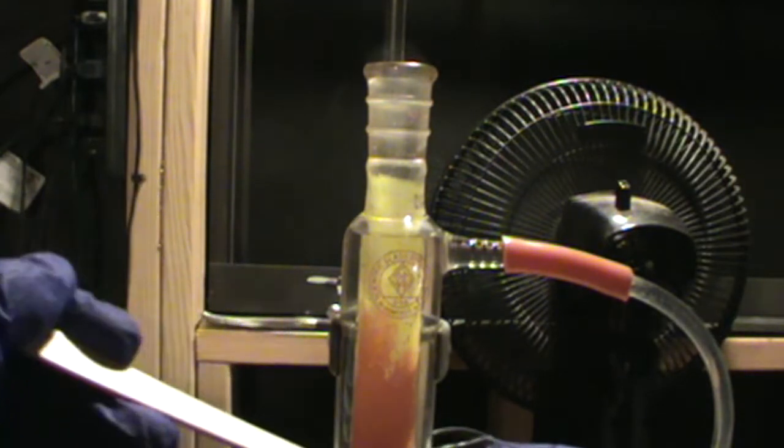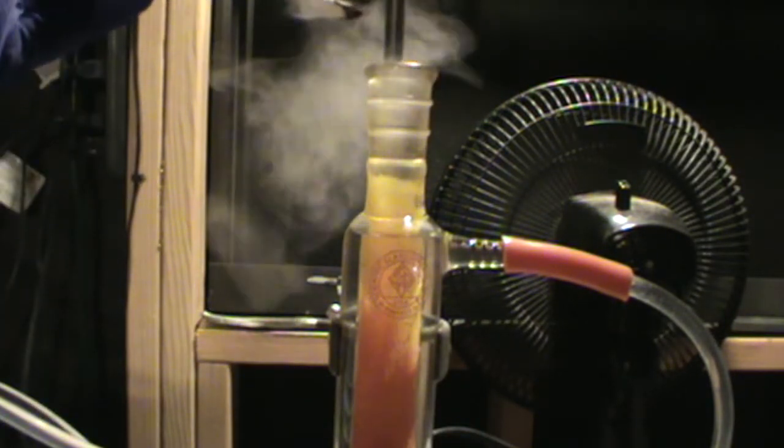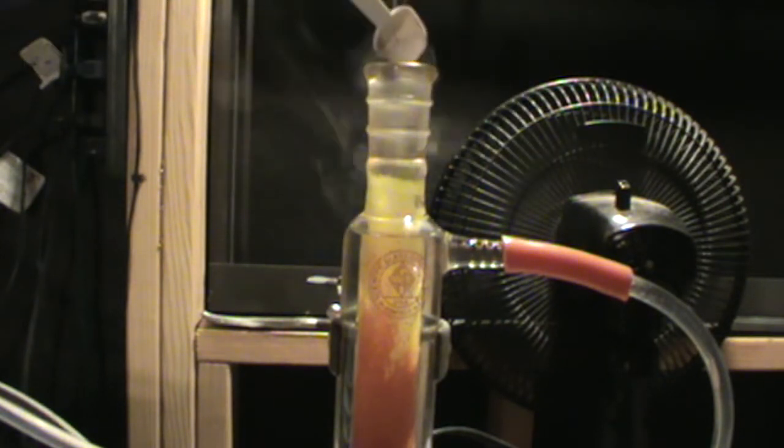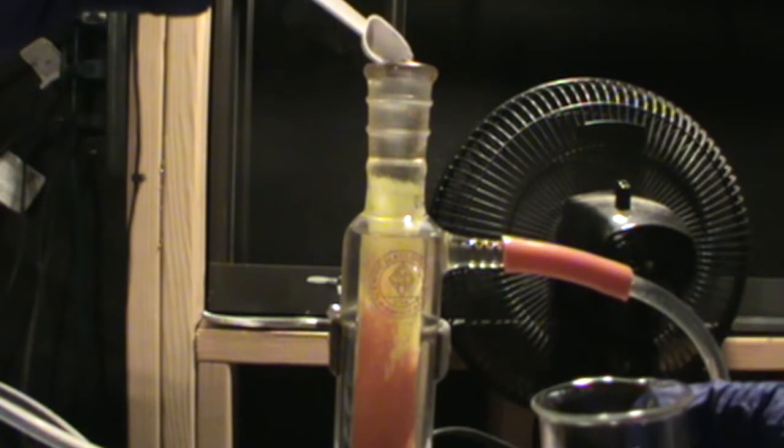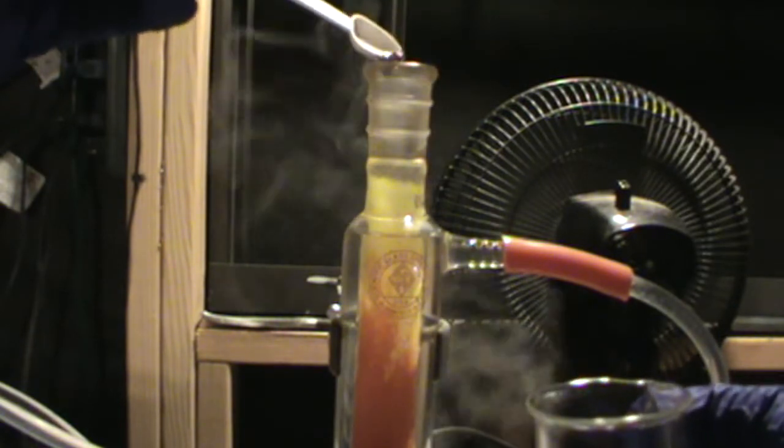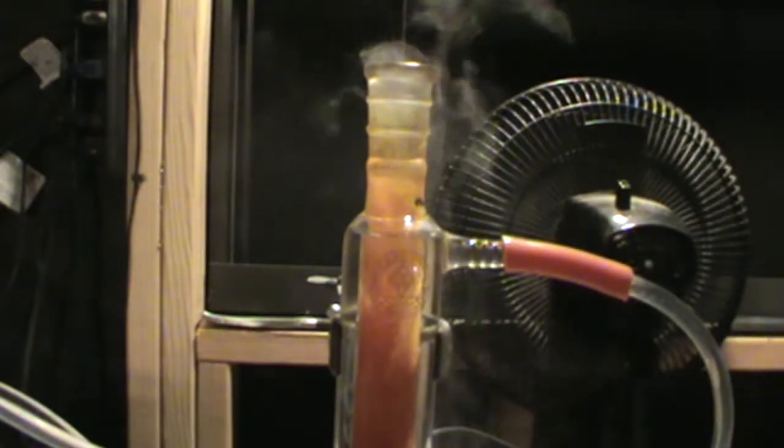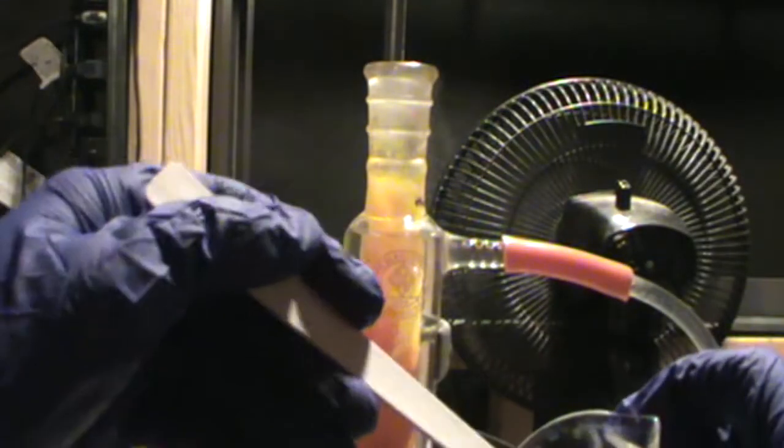The yellow-orange substance coating the sides of the condenser is mostly phosphorus pentabromide. This is formed when phosphorus tribromide reacts with excess bromine. Phosphorus pentobromide will decompose under heating to form phosphorus tribromide and bromine. This bromine can then be reacted with excess phosphorus, so that all of the product will be phosphorus tribromide.